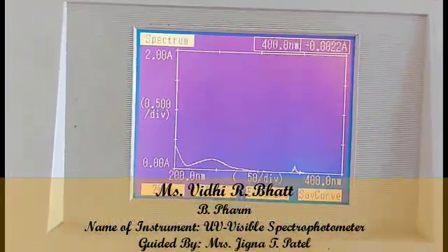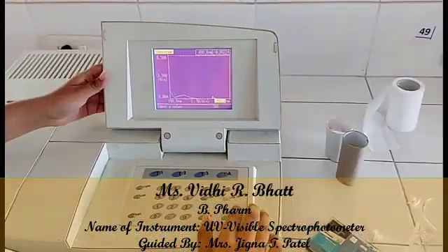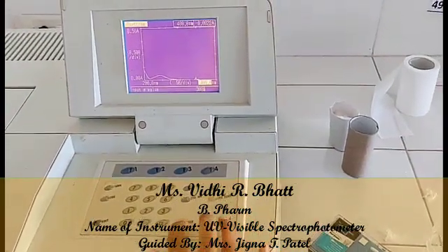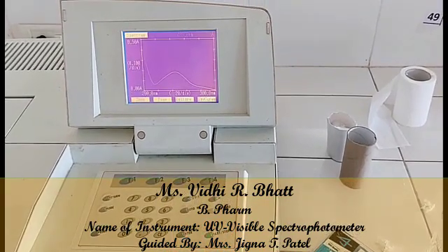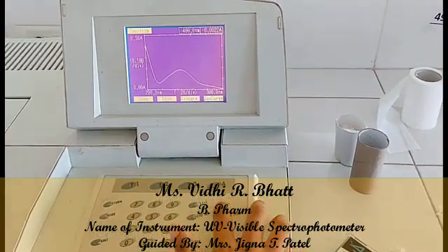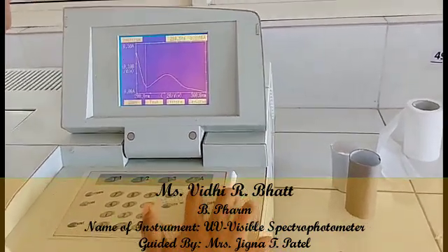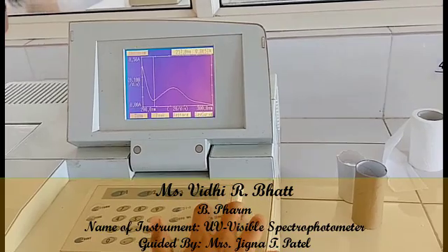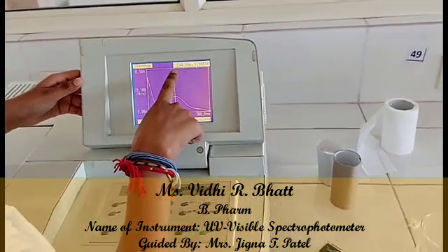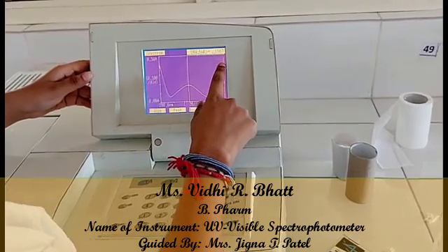Here we observe the graph of lambda max of the PCM analyte solution. We zoom the absorbance range to 200 to 300 nanometers. The peak is observed at 244.5 nanometers with an absorbance of 0.1847.